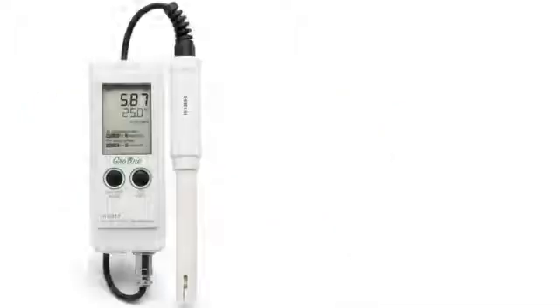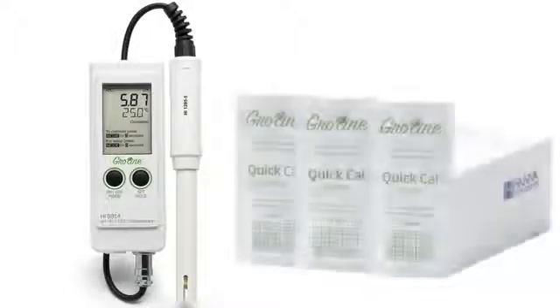Today, we will be performing a quick calibration using the HI50036P quick calibration solution.